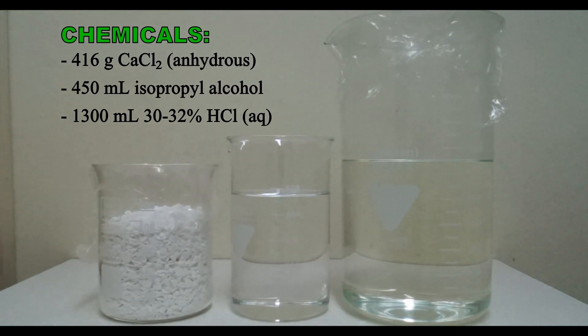For making isopropyl chloride, the following chemicals are needed. From left to right we have anhydrous calcium chloride. The one I used was intended for use in dehumidifiers and was purchased in a supermarket.